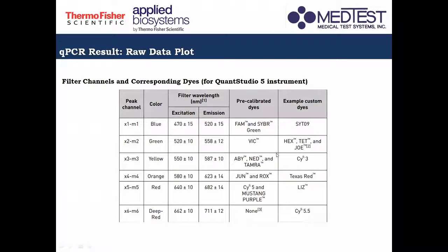Now, if you are going to use a detection kit that uses a dye that is not listed here, no, we have to calibrate it, no. But normally for Quant Studio 5, kung ano lang po yung custom dyes, yun lang po yung pwede nating i-calibrate. So for example, if your detection kit uses a Texas red dye, we have to calibrate the Quant Studio 5 with a Texas red dye.